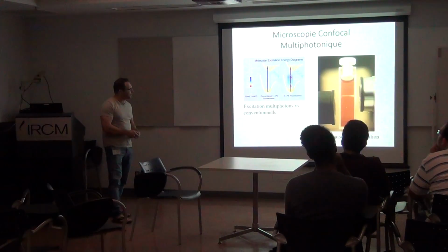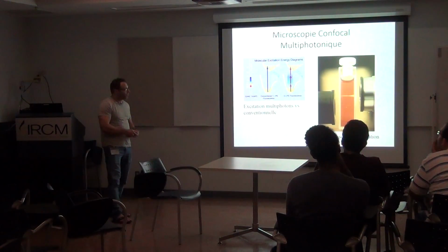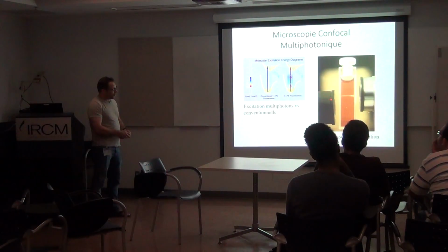And you see that it occurs rarely in the back here, because the absorption is mostly done at the beginning, and then there are many absorbed photons, and here there are no more photons, so there is no more absorption. So you only see light from here. But here, photons are not absorbed, and only at the focus they are absorbed. Okay?